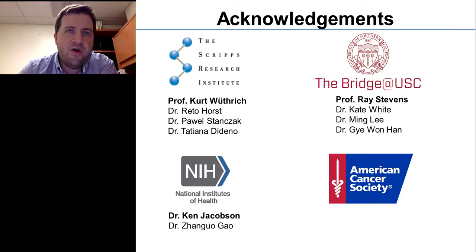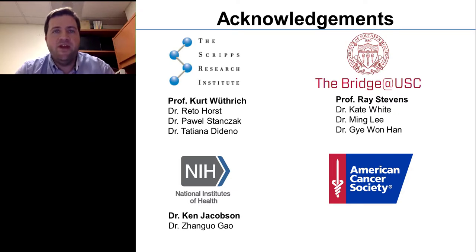In addition to that, we're pursuing additional techniques using more sophisticated spectroscopy, as well as including carbon-13 labeling, to be able to assign even more of the signals that you saw. That will give us a denser network of NMR probes that will allow us to better and better refine our view of signaling and signaling pathways in GPCRs.